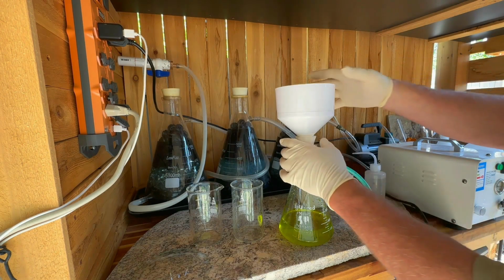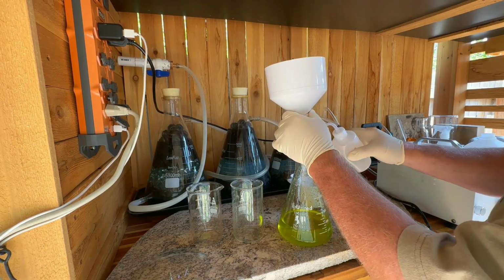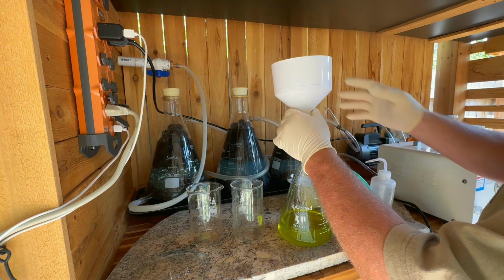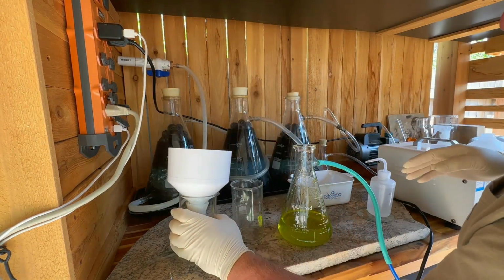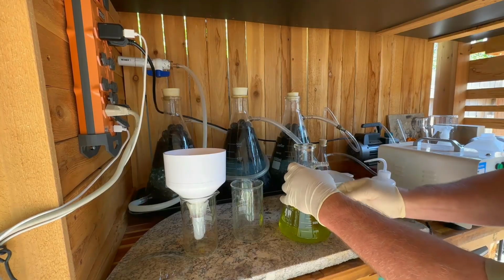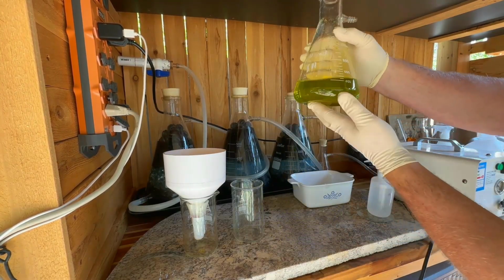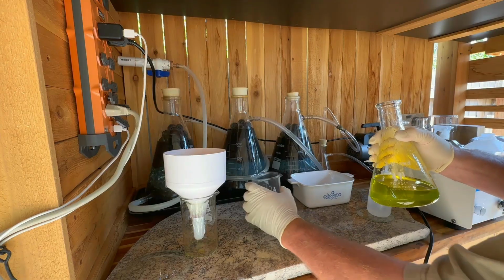All right, so we've completed our first filter. So we'll go ahead and take a look at what we got here. Let's take the filter off, put it in a beaker, and see if I can get the vacuum pump unhooked here. Not too bad that time. That solution, it's clearish. You can still see a little fog in there.